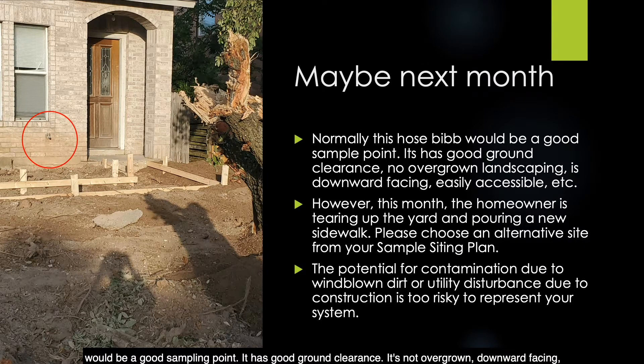Normally this hose bib would be a good sampling point — good ground clearance, not overgrown, downward facing. However, this month the homeowner is tearing up the yard and pouring a new sidewalk. Please choose an alternative site from your sample siting plan. The potential for contamination due to windblown dirt or utility disturbance from construction is too risky for this site to represent your system.